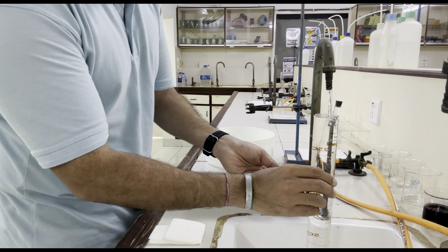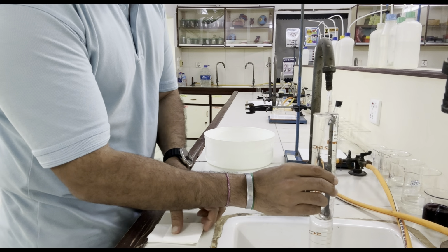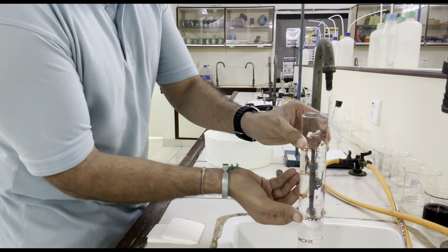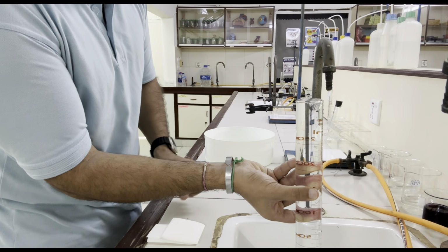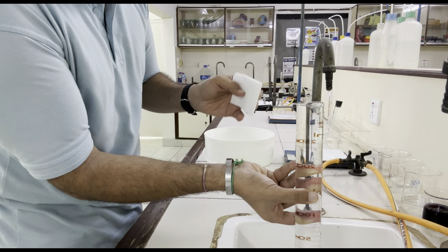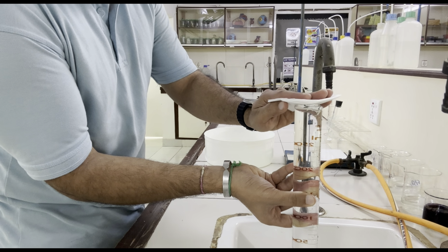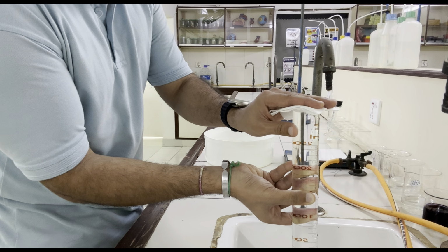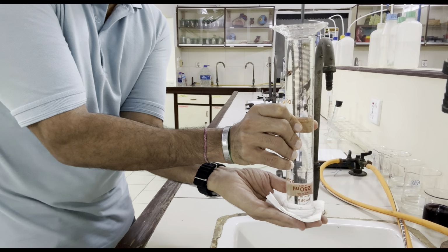Completely means like this. It must be complete. Now, once I have to put this in an inverted position, I will invert my hand first, and then I will cover this like this so that there must be no air bubbles. Now, once I flip, you can see there is no air bubble coming up.